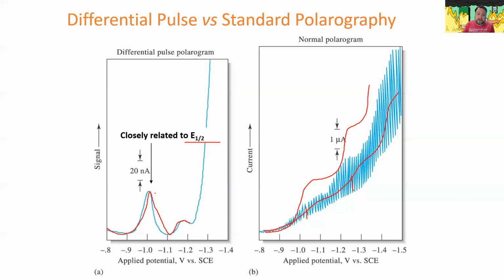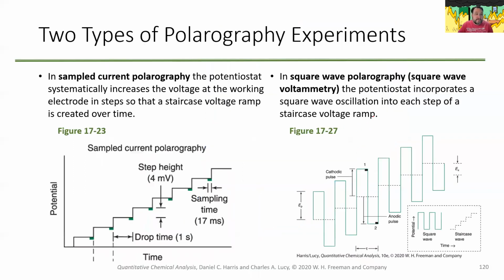What do you have? And the reason why you'd want to do this is that you can do this at very, very low concentrations. So this is why it is something that they will still use in pharmaceutical research, because you're dealing with very low concentrations of drug molecules. And because this is happening at a particular potential, you can do this experiment in fairly complex matrices like blood plasma without having interferences from other species. Because your E1/2 is going to be unique to the molecule you're looking at, or at least pretty differentiable from other ones, and because your polarography lets you get down to really, really low concentrations, it can sometimes be a suitable technique for looking at those hard to see drug molecules that are floating around with a bunch of other stuff. So it's not completely useless, it's just a gigantic pain in the ass.